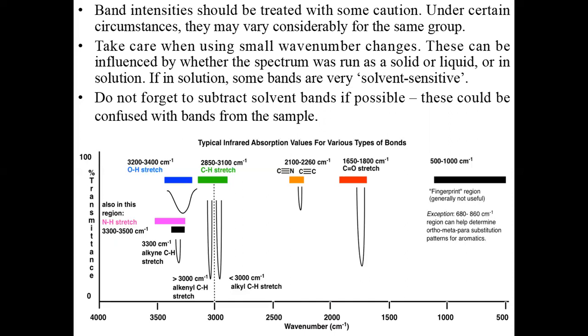And in this diagram, we can see the different bond stretchings are present at different regions of the spectrum.